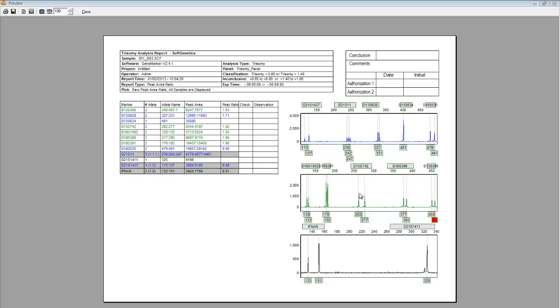Corresponding electropherograms are also included. Finally, a validation box is in the upper right-hand corner for expert review. These reports can be printed directly, or saved as .png files.